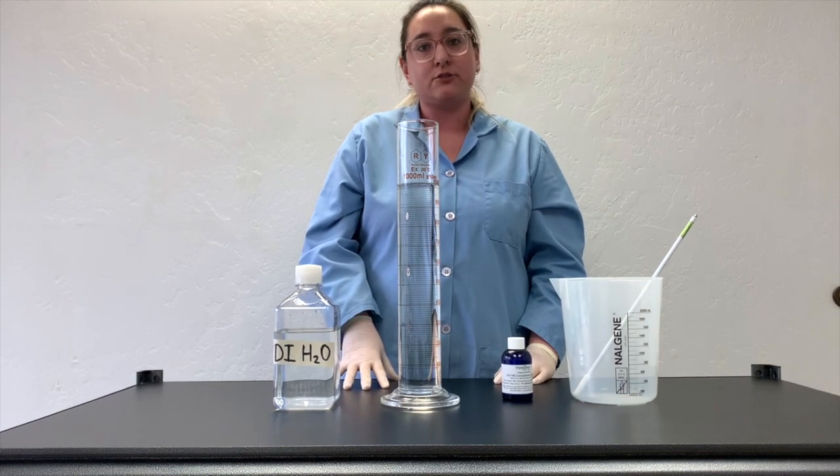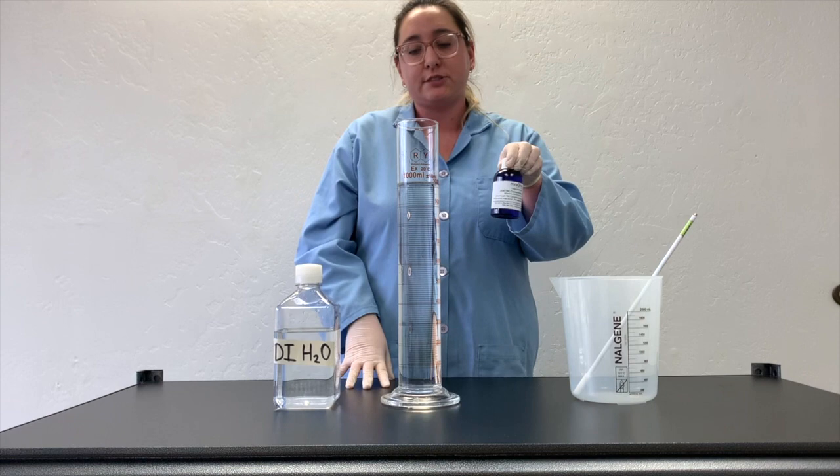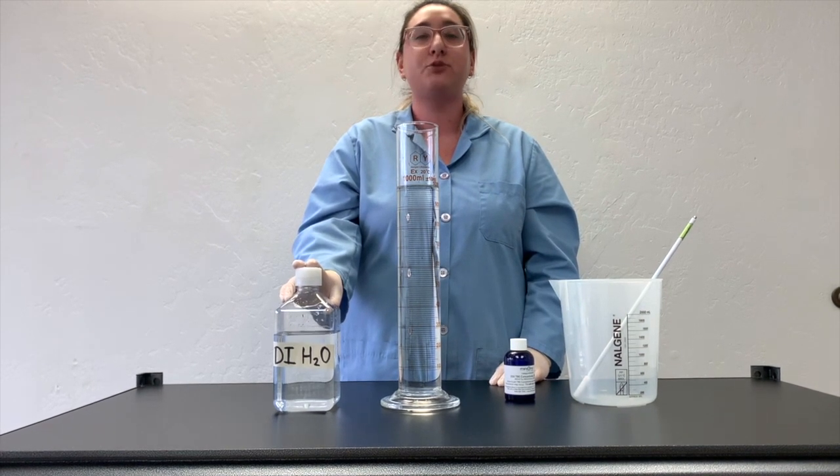To perform the dilution, you want to combine 100 milliliters of your buffer concentrate with 1,900 milliliters of water to make a final volume of two liters.